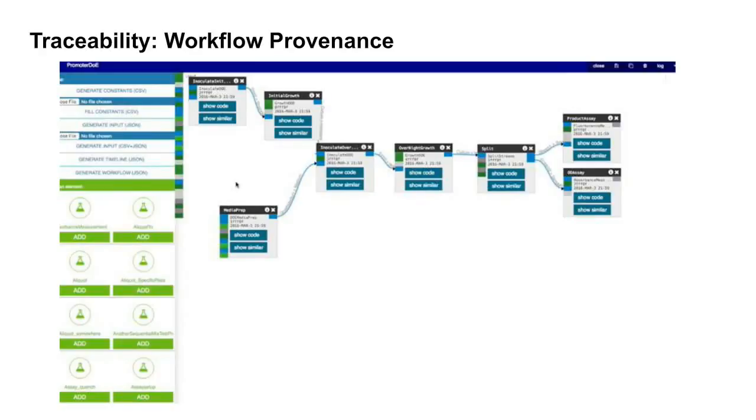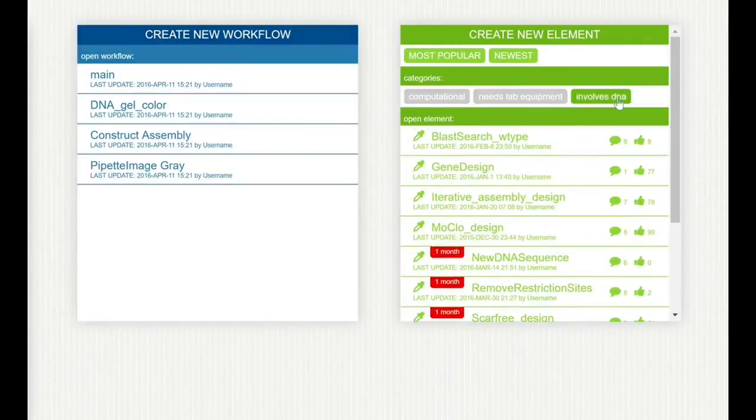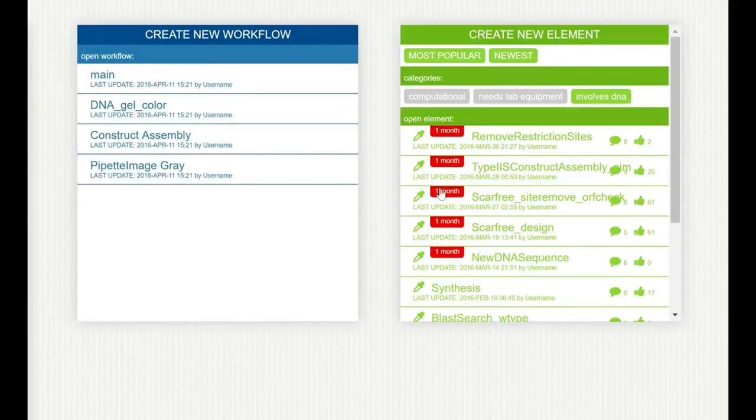The next major step about working with Antha is to define what's the experimental workflow that you want to run. Of course, that's easiest to do by showing you. Before you can run an experiment, it's important to actually define what experiment you're planning to conduct. Antha provides repositories of your elements and workflows that can be shared both on an individual or organizational basis.